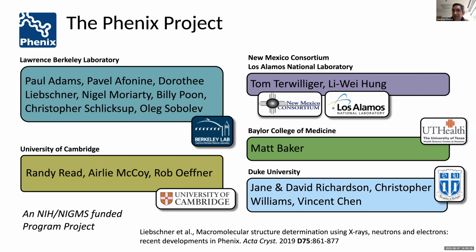So I have a question about these optimizations of pockets. There's experimental information on heavier atoms and not hydrogen, and also atoms that tend to stay in place. I guess some of the water that's not locked into place is also somewhat invisible.